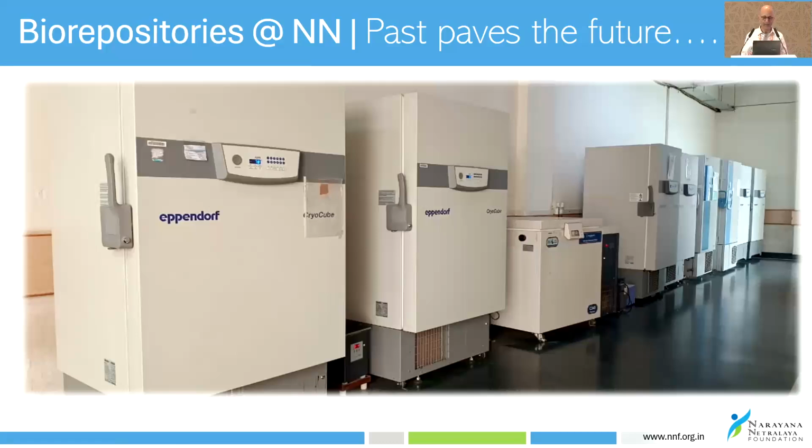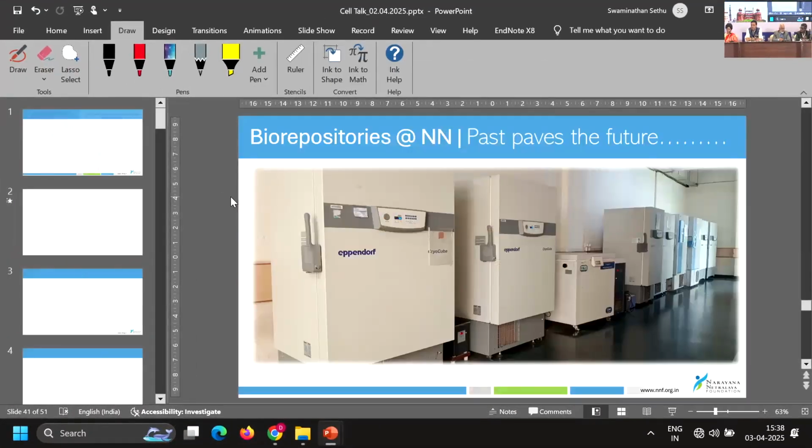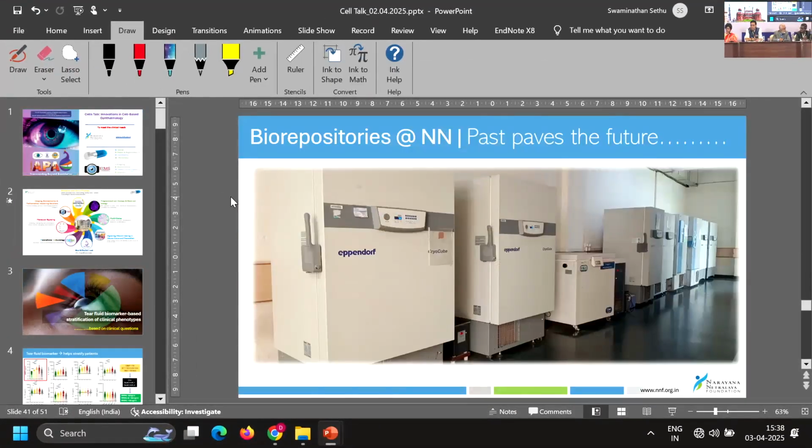And also, Sangwan sir is here. I think we have not been able to achieve his level, of course, in regenerative stem cells, but at least somewhere close by with his inspiration. If you can just show the work happening on Western blotting and qPCR.